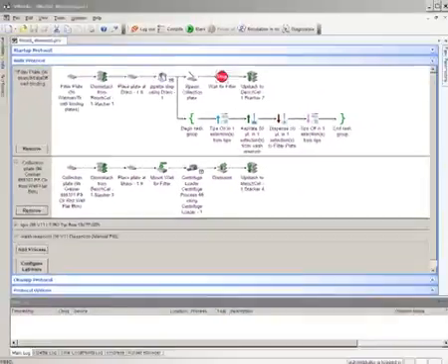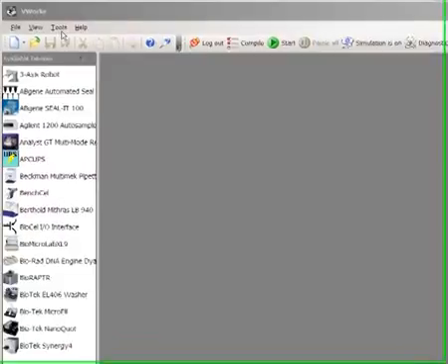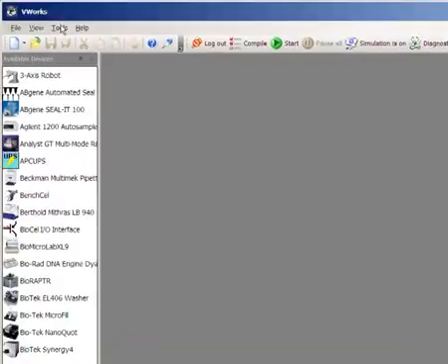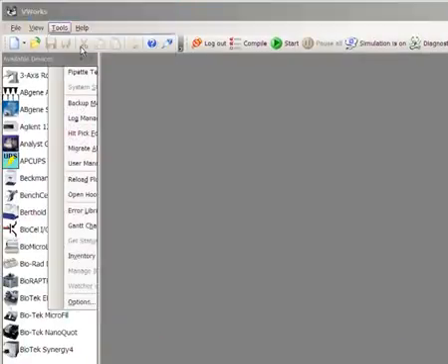To use the mount and dismount tasks, I have to first make sure the filter plate and collection plate are defined correctly in the Labware Editor. So let's open up the Labware Editor. I will go to Tools and click Labware Editor.